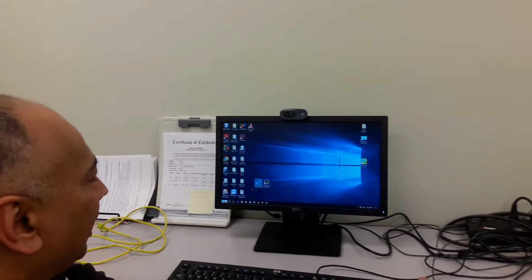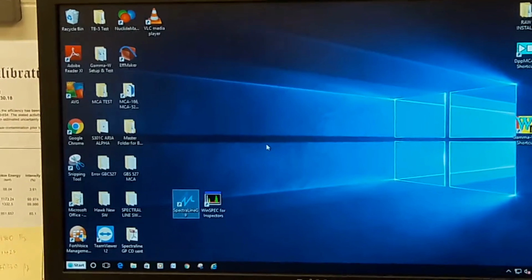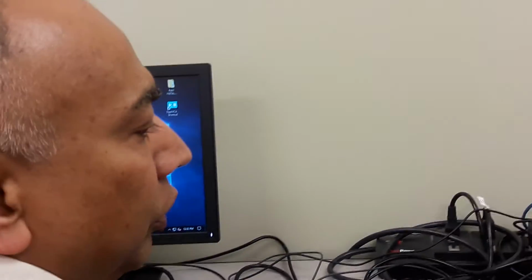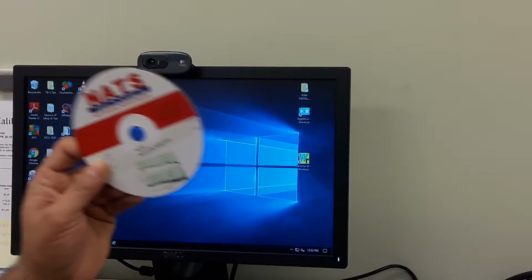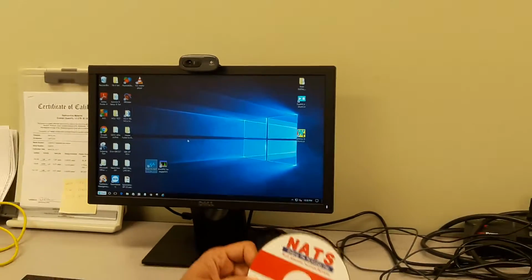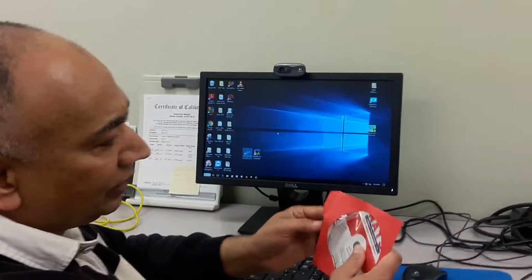This WinSpec is supplied by GBS Electronic in Germany, and usually this software is going to be supplied to you either in the form of a flash memory from us, which will have the latest version of the software, or in some cases it might have a CD like this, or it can have a separate CD that will have the WinSpec software in it. In this particular CD, we have everything. We have the gamma analysis software, the MCA emulation software, and everything in the single CD.